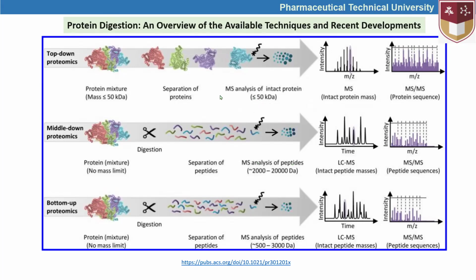Based on this kind of capacities of the mass spectrometers, we can develop our own approaches.